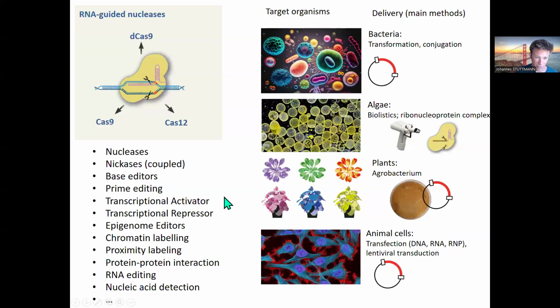I think this is the last slide that I presented to you about CRISPR technologies in my little PowerPoint. And the point I wanted to make here is that actually, if we want to use these CRISPR technologies, in most cases, we will use plasmids. And in this case, we will have to manipulate these plasmids.